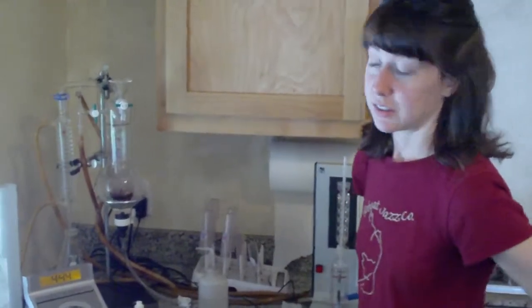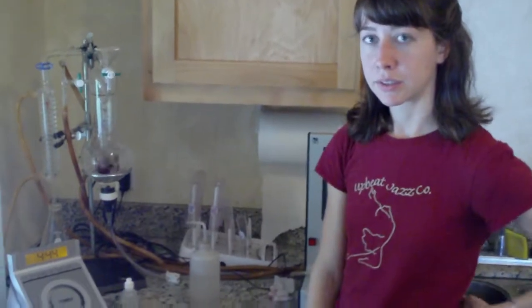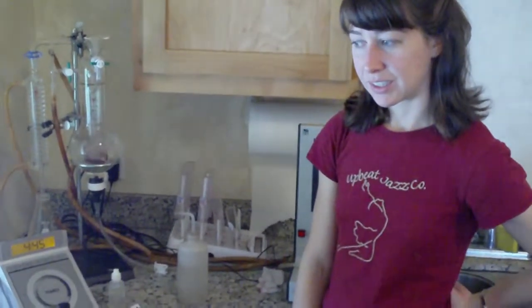You definitely don't want one of the ideas. Yeah. So it's just, this is like, this is the nasty acid that's being... Right. Of all of the compounds we've looked at so far, that's the least desirable thing, huh?